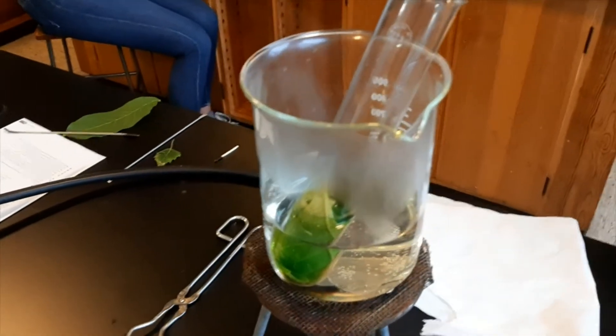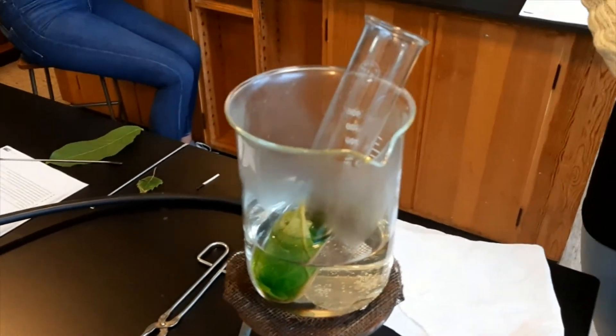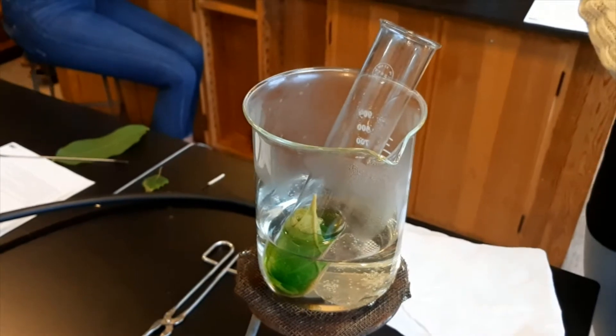Now the leaf has been here for six minutes, so my highly skilled students will take out the leaf.